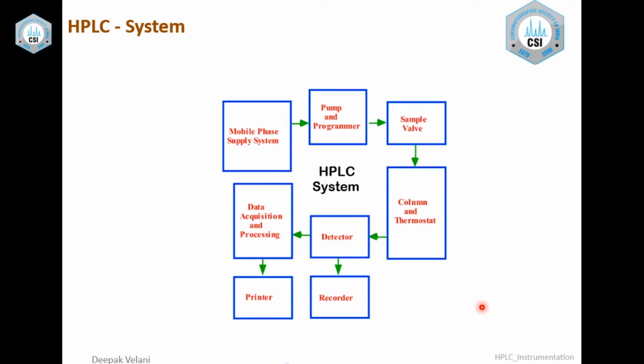Nowadays, a printer is not required, because you can convert the report into PDF files and directly email it to the people concerned, or if a hard copy is required, you can go for it.